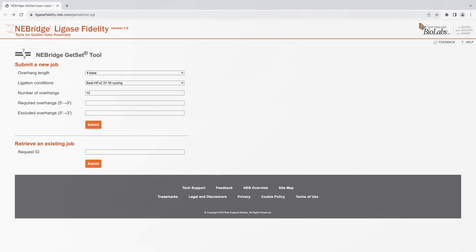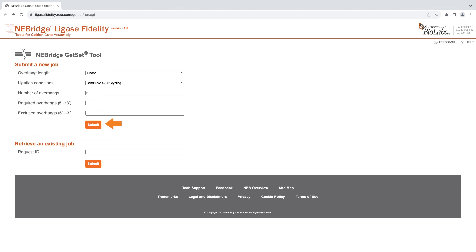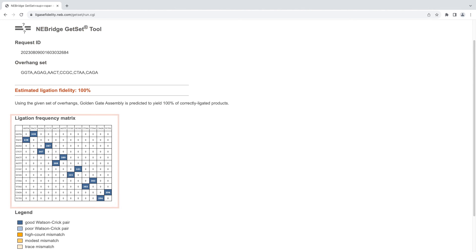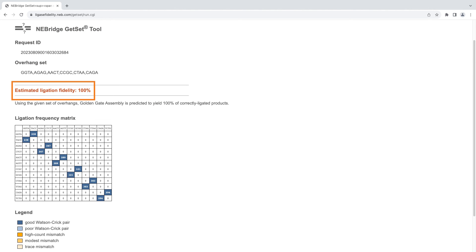For example, here we request six optimized overhangs for a six-piece assembly. Prompting Get Set with our desired Type 2S enzyme, ligation conditions, and the number of desired overhangs gives us this set of overhangs with an estimated ligation fidelity of 100%.